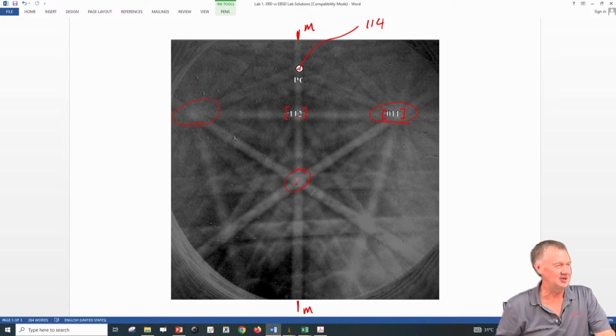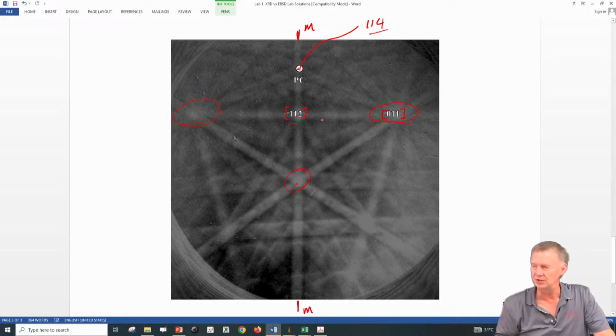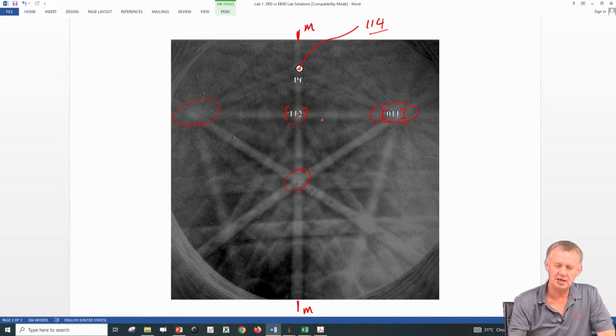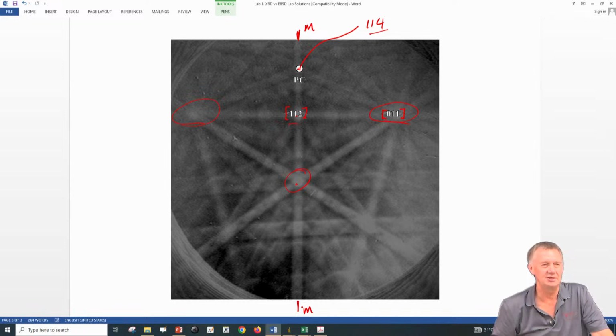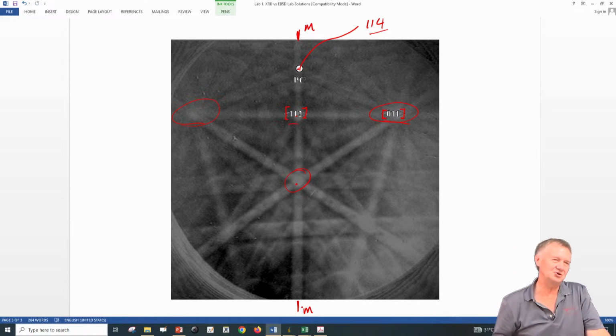Okay, so did somebody do the dot product or the cross product, or somebody can figure it out just because 114 and 112 both have to be normal? 114 and 112 both have to be normal. Or you can say, oh, this is that silicon calibration sample, so I know the vertical line is the cleavage plane. Do you remember the cleavage plane in silicon? Somebody's calculating, right? I'm waiting for an answer.